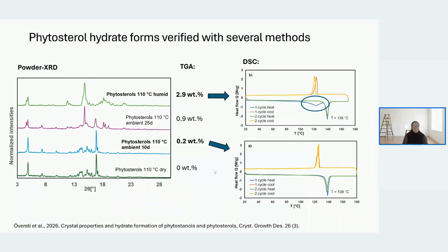Then the final topic, and actually our recent publication, is related to this hydrate formation. Phytosterols are known to form hydrates, and we have also now verified that with several methods. First we had the phytosterol material dried fully at 110 centigrade and vacuum. We can observe in this powder XRD pattern that it forms anhydrate, and also that the TGA shows that there is no water in the structure.